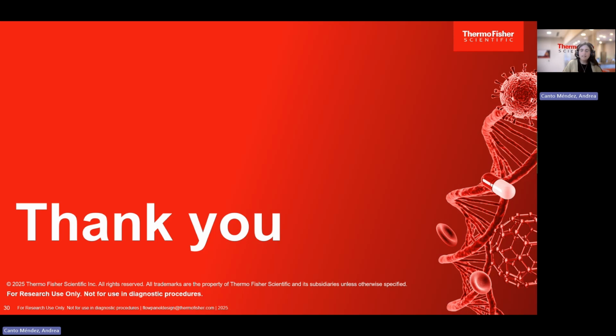And then we can use antibody independent methods, let's say. For example, one method we can use via flow cytometry that was not mentioned in the presentation is PrimeFlow. With PrimeFlow, we can measure mRNA levels directly in our cells via flow cytometry. So instead of measuring the protein itself, we can measure the mRNA expression, which can, for example, give us enough sensitivity to detect this desired target.